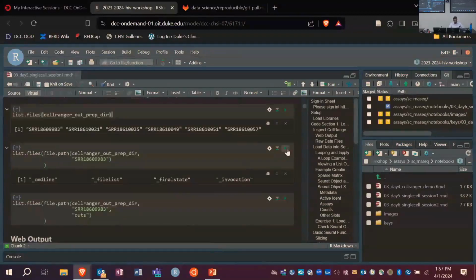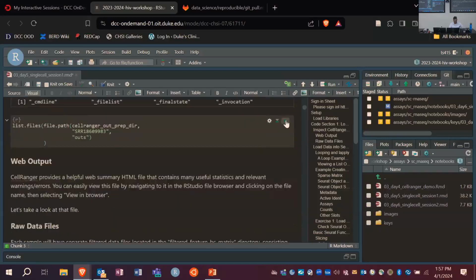And we can take a look within one of those directories. So we just pick one. You can see that, oops, I think the output is cut off here. One second. Man, this is being really slow.